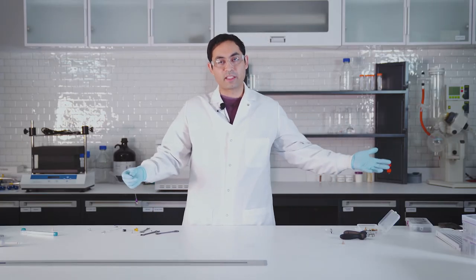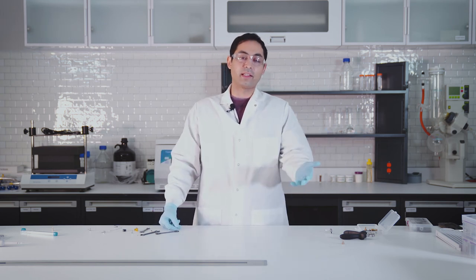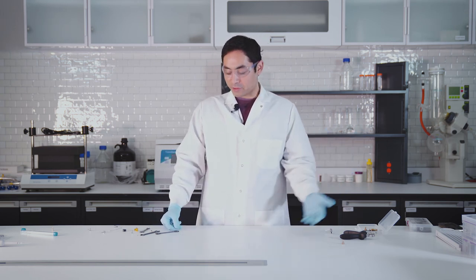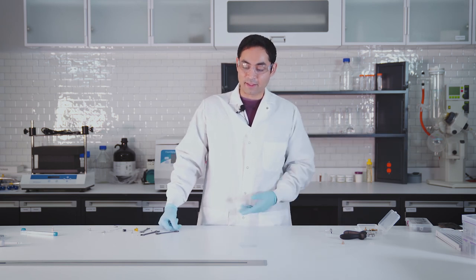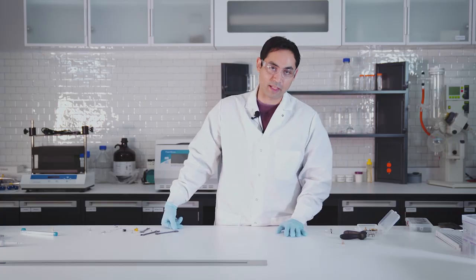So that gives you a rundown of all the different types of tubings and fittings. You can figure out and see which one meets your needs. But I would definitely try to stay away from the stainless stuff and use some of this newer type of tubing and fitting. It's gonna make your life a lot easier.